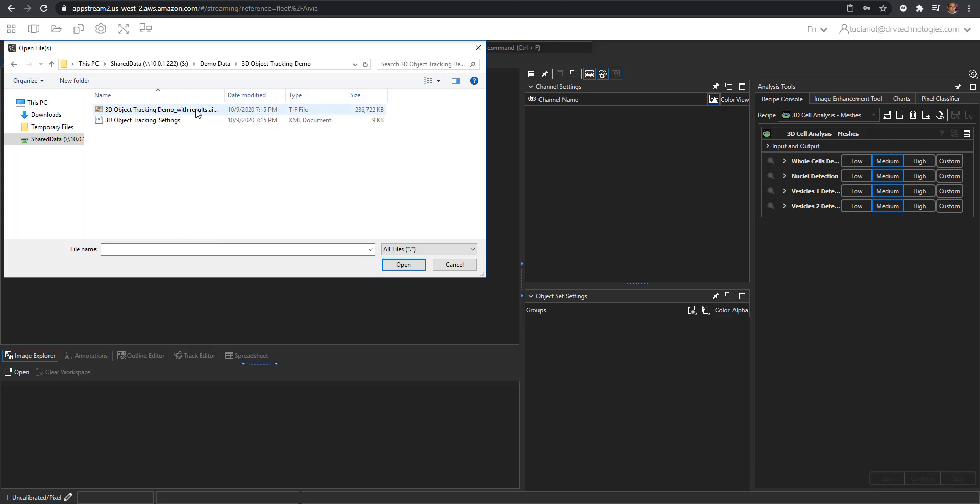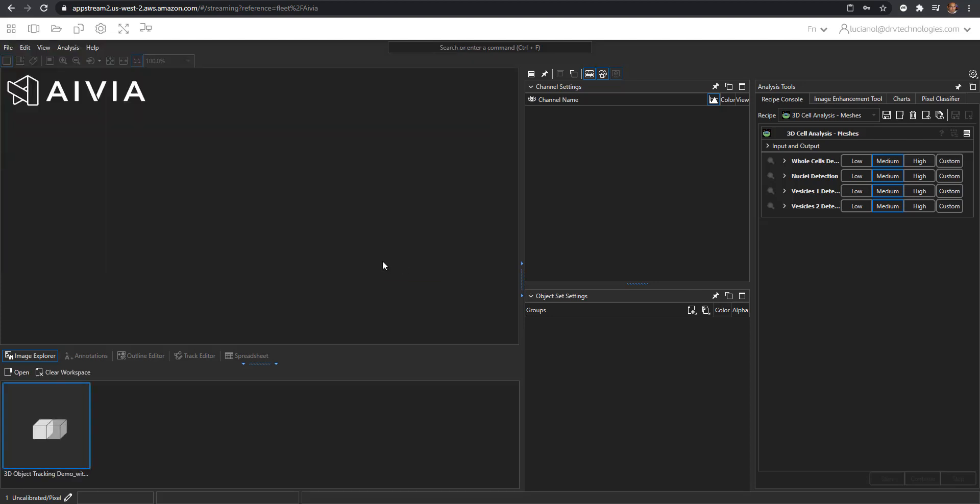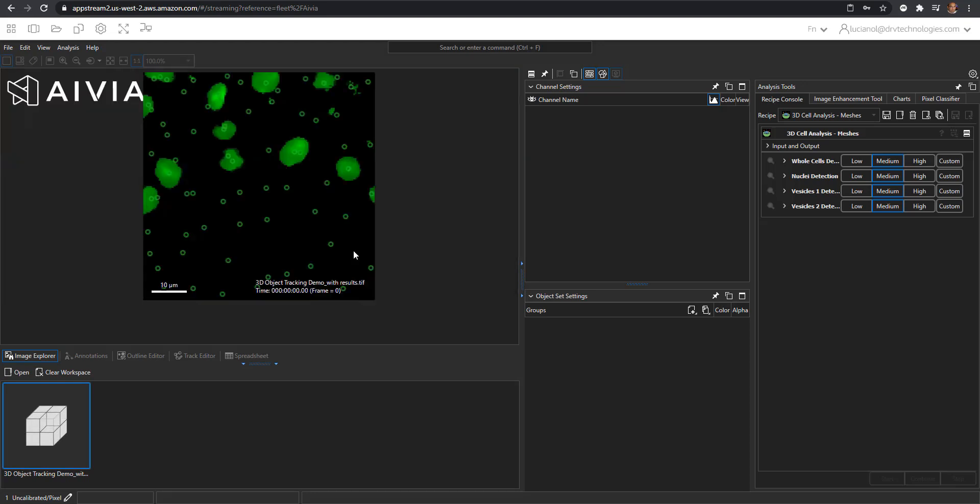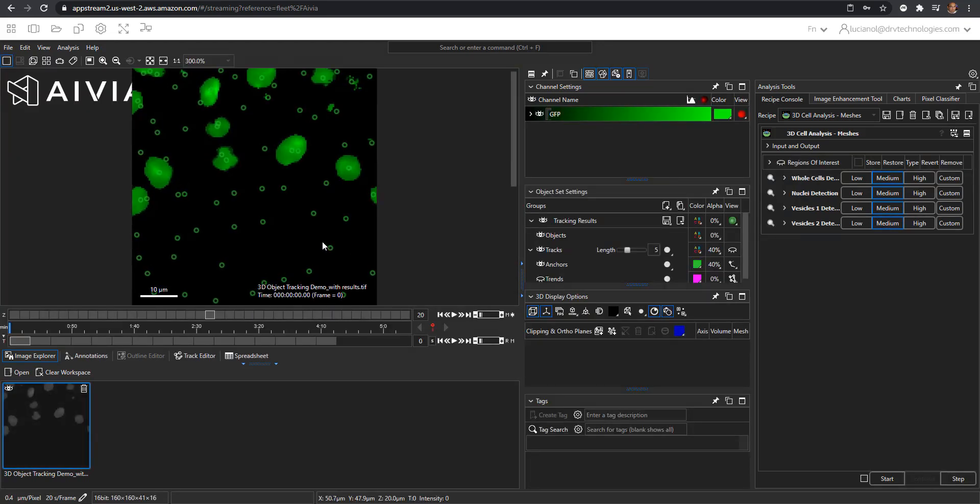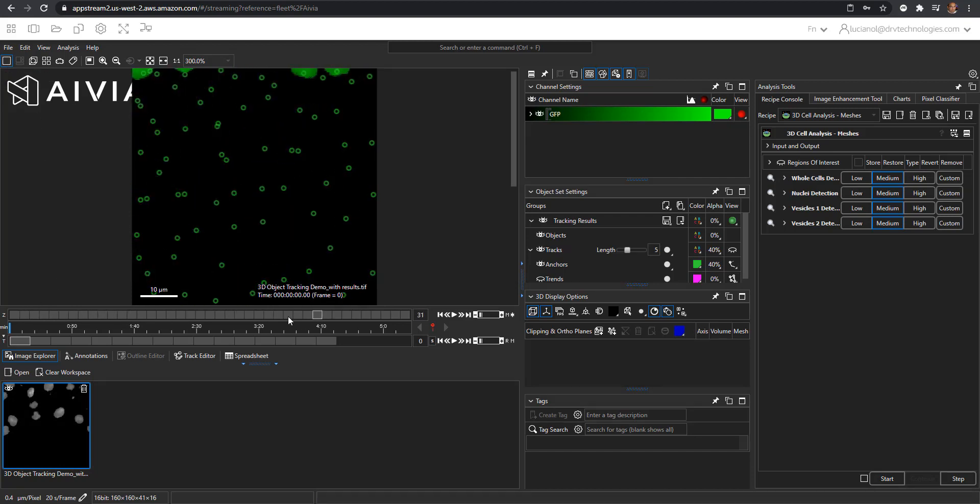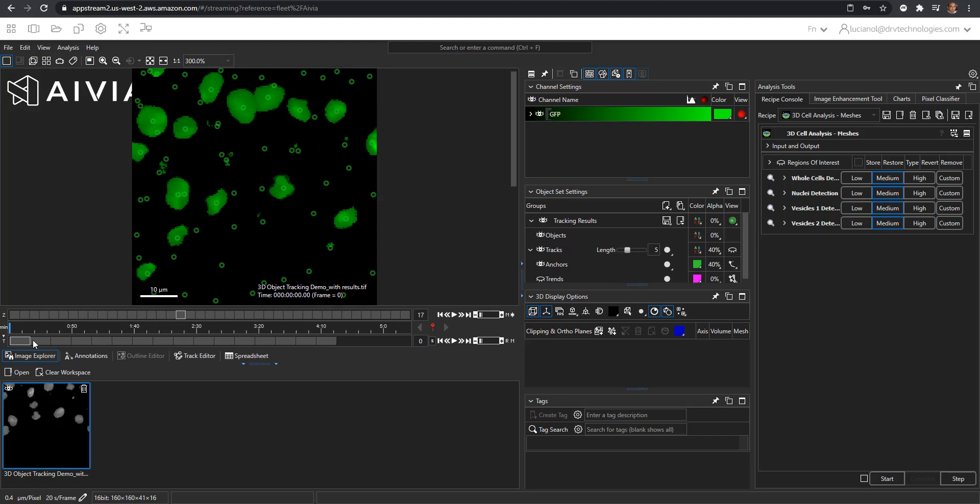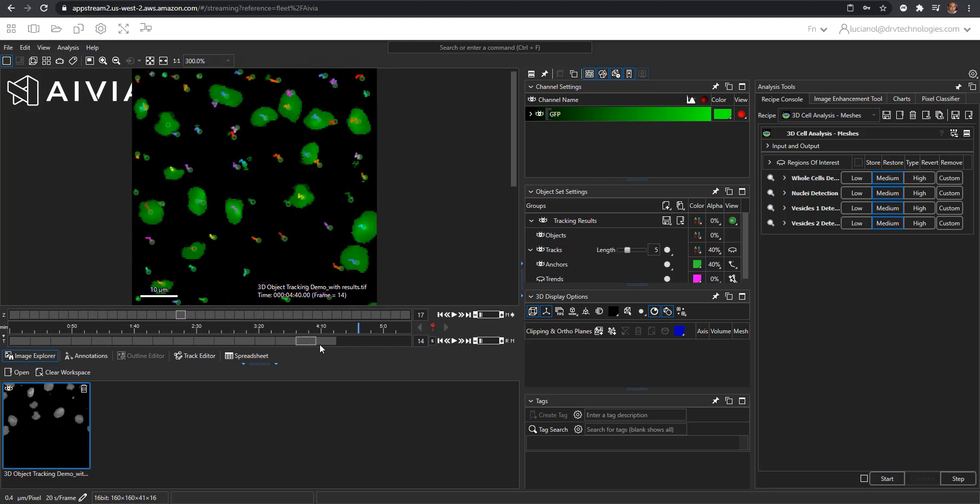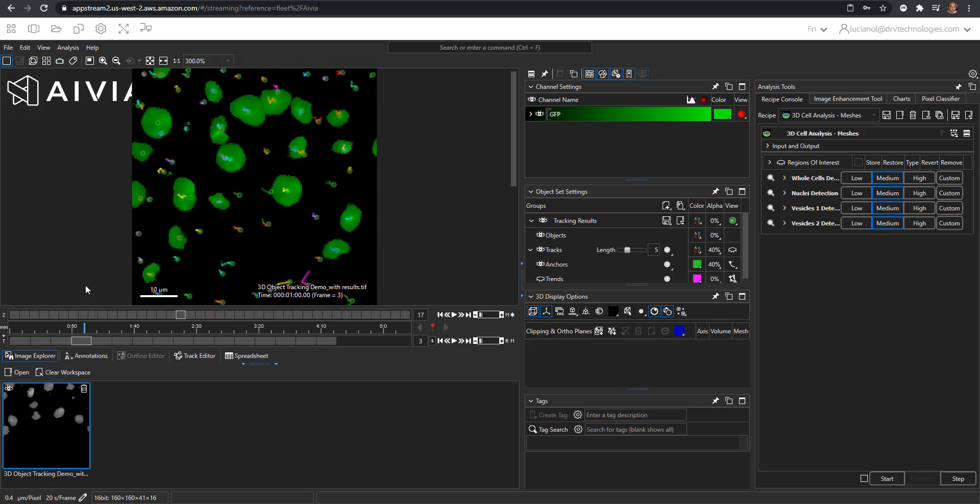Open the dataset that is on the top. The dataset will open initially in the 2D space in the main view and you can explore it in Z and in time. But I will move to the 3D view.